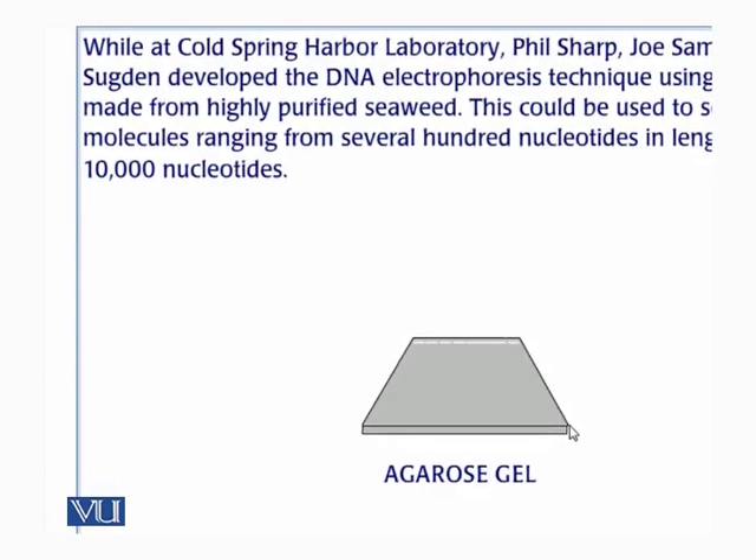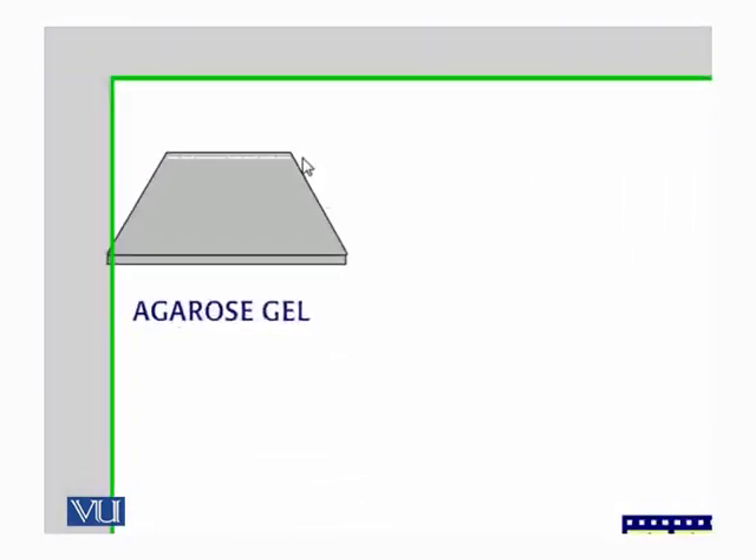The agarose gel is made from purified seaweed, and we can pour it like gel used at home and make it any shape we want. In this case, we are making it a rectangular shape. We have placed a comb at one end of the gel, and when we remove the comb, the spaces where the teeth were form little wells in which we can add our DNA sample.